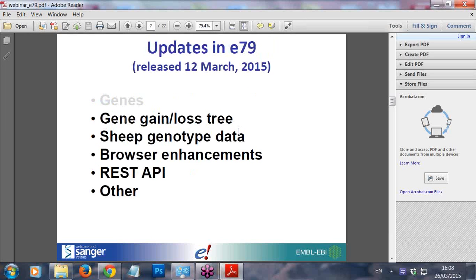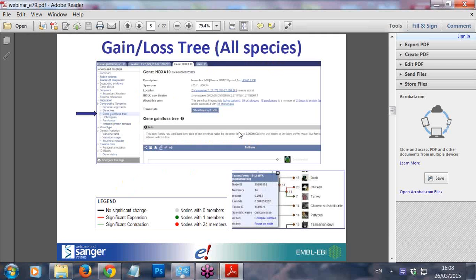Moving on to the gene gain/loss tree. We've had it in the Ensembl browser for quite a few releases. If you go to any gene — for example the HoxA10 gene — in the left-hand menu you can see the gene gain/loss tree link. This allows you to view a comparison with the species tree of the current state of genes in different species. It will tell you if an ancestor seems to have had, say, 14 genes, if there's been a dramatic increase — shown in red for significant expansion — or a dramatic loss — shown in green for significant contraction — as we see for chicken and turkey respectively.